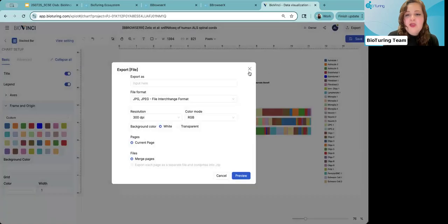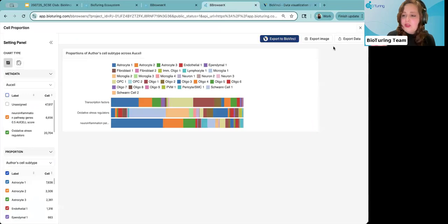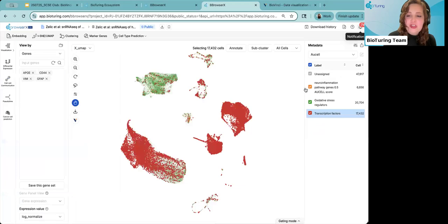Okay. So this is where you can start working on both systems. This was sort of the second part, which is really how can we map out these different proportions and actually annotate either density scores or enrichment scores from an entire gene set across different cell populations. So that's the second part.